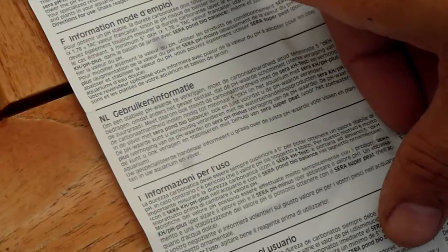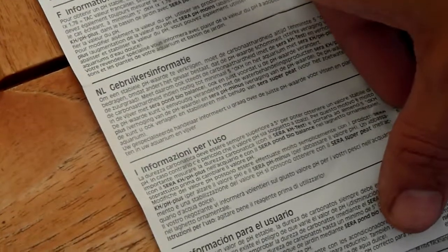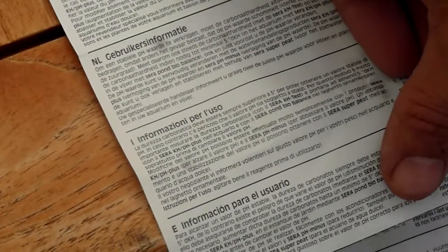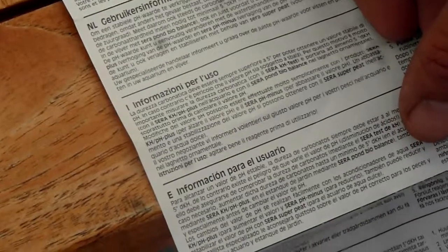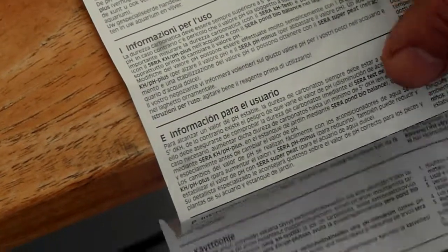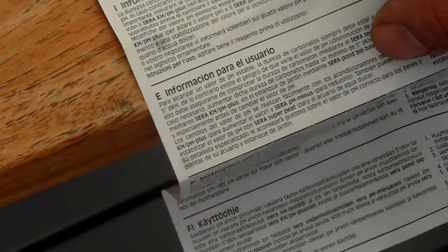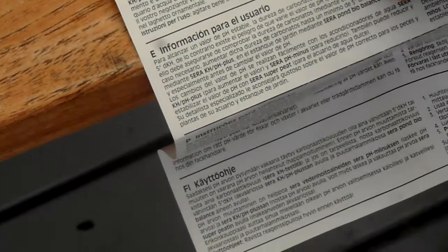It says here I need to ensure to maintain carbonate hardness of at least 5 degrees dKH. I have to look up what that means.